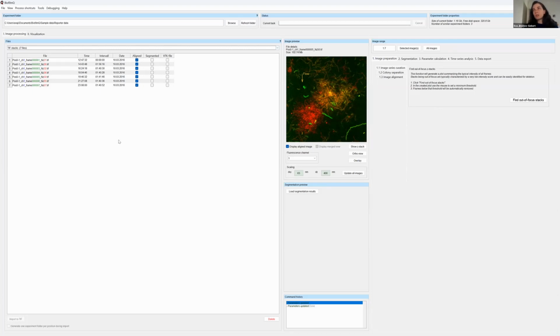If that doesn't work, what always works is to go into the viewer of the software that you're using for imaging, select the TIFF export, and then import the TIFF into BiofilmQ. But then Niklas is going to show you probably tomorrow how to do that.